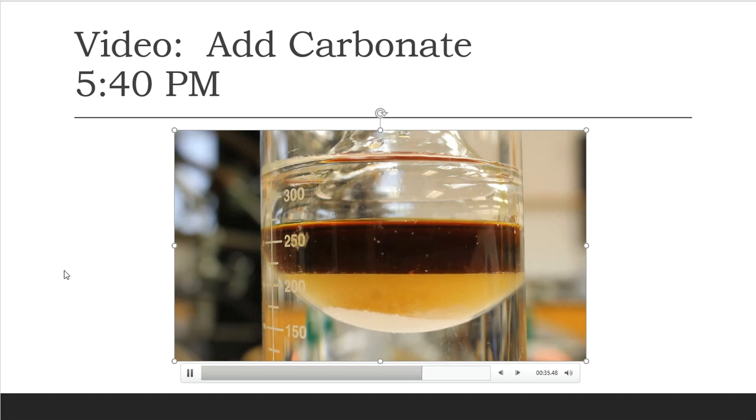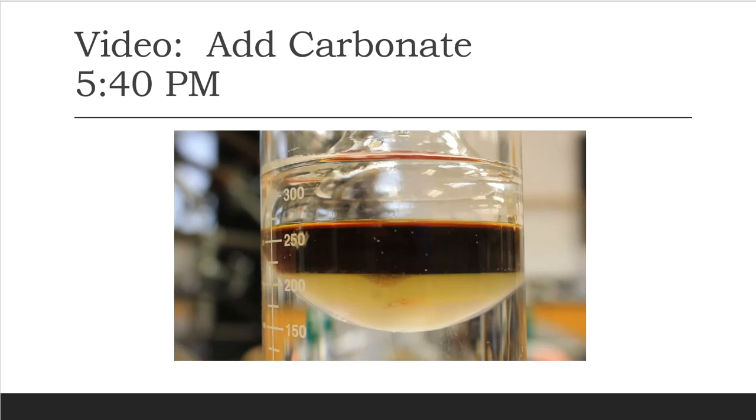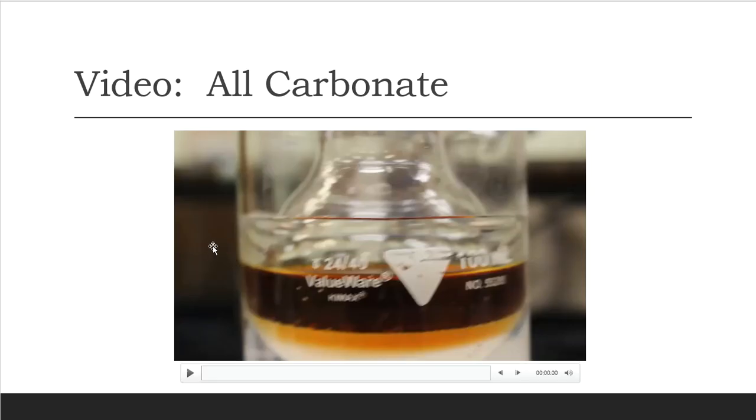All right, so I'm going to continue to add this in really small batches at a time just to see what goes on at the very end of this addition. Well, as you can imagine, not all the carbonate was added in. I still had a little bit of residue that was left in my weigh boat. That's perfectly okay, not a problem. I put it in the trash and I move on about my business. All right, so in this video, all the carbonate has been added.